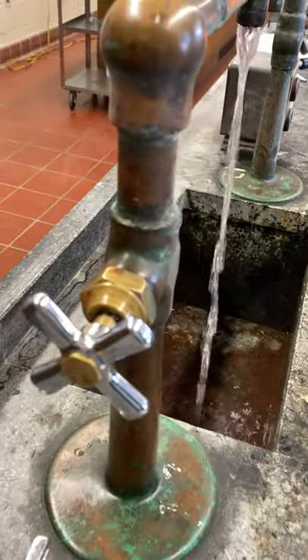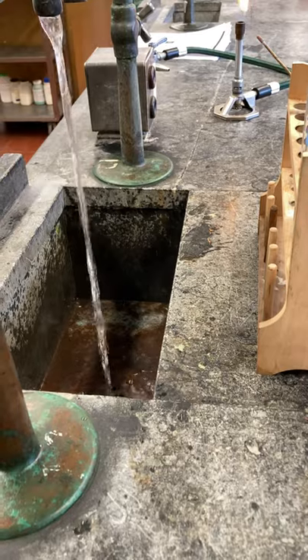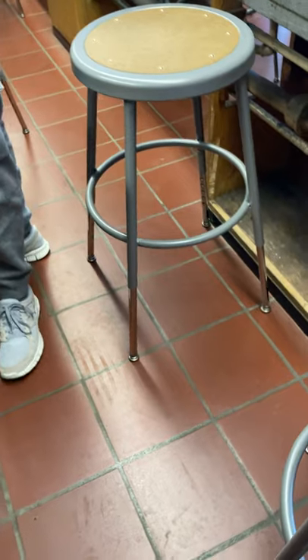Red, very intense. I agree. You just come by and steal answers, bro. Calling 4K. Orange. I don't know which one is which. Yeah, I know. We had to ask him which one was sodium, because he walked by and told us sodium. But we knew lithium over here was red, which is LiCl. No, it's LiCl.